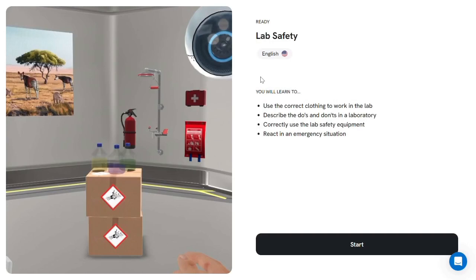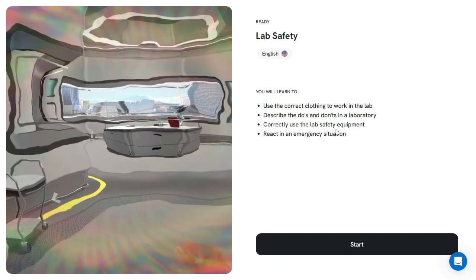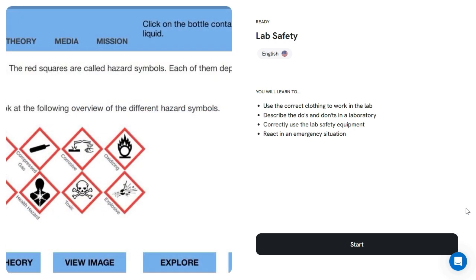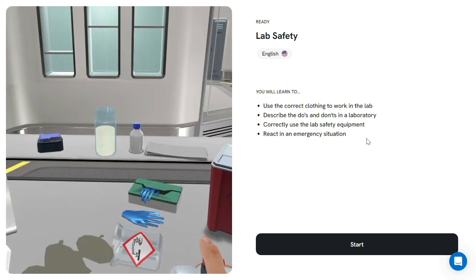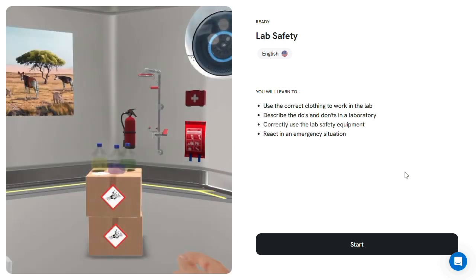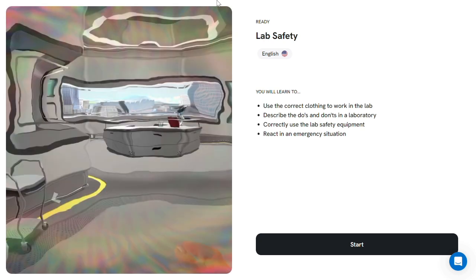Labster is an innovative platform designed to revolutionize science education through virtual laboratories. It offers a suite of interactive lab simulations that allow students to conduct experiments and learn scientific concepts in a safe, cost-effective, and engaging virtual environment. Developed by real scientists, Labster's simulations are based on mathematical algorithms that support open-ended investigations, making it a valuable educational tool for students and educators alike.